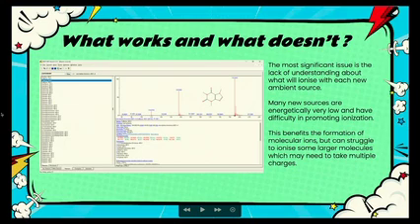So that's out there, but whilst we know, and obviously there are the Metlin libraries and things, we know what works with ESI and EI very, very well, and there's hundreds of thousands of papers with individual analytes and source conditions to get them to ionize. Less well understood with some of the ambient sources, so there's a little bit of a void, and if you do embark on doing ambient ionization work, you'll find you do a little bit of work to find out what settings you need to use to get analytes of interest to ionize.